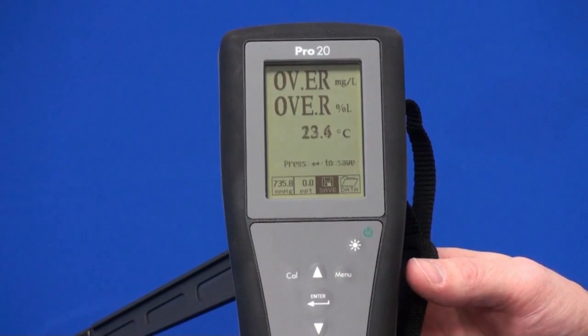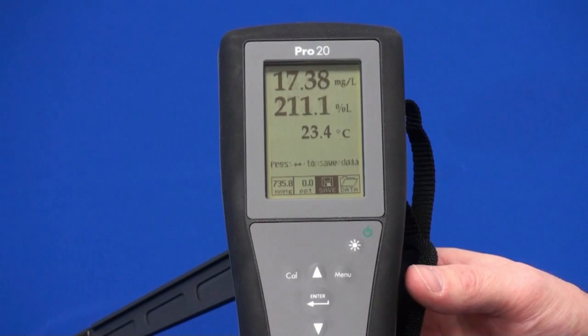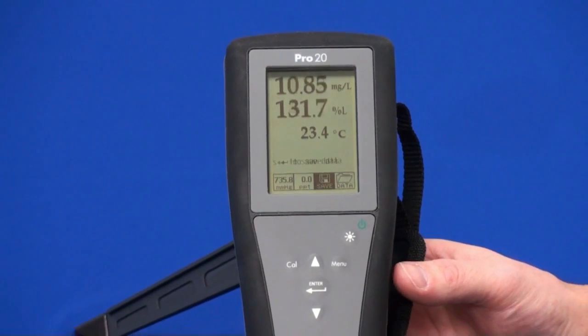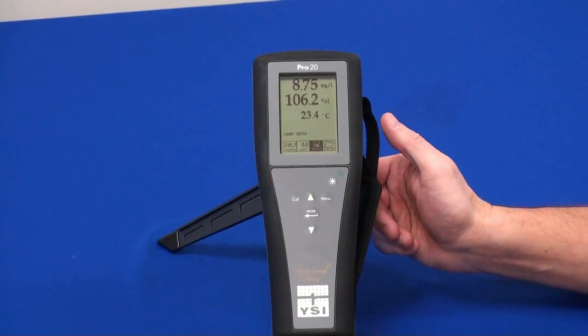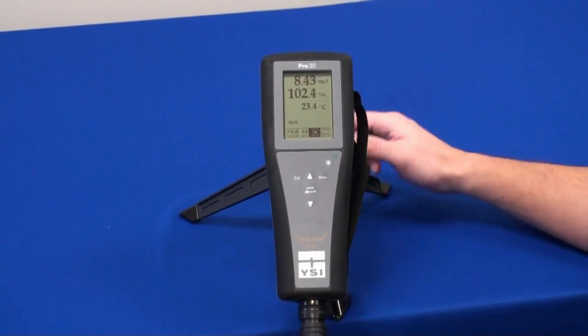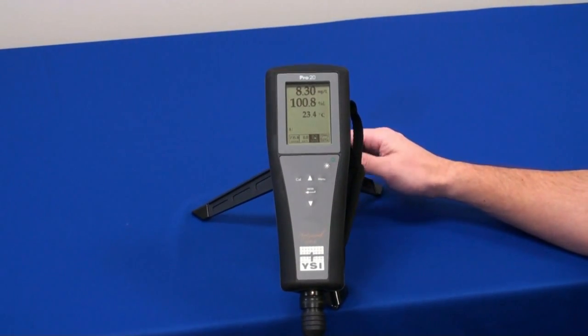Once you do that, the instrument is going to go directly into run mode and start giving readings. It will take a short amount of time to warm up. Once that is done, you will be able to calibrate the instrument and use it.